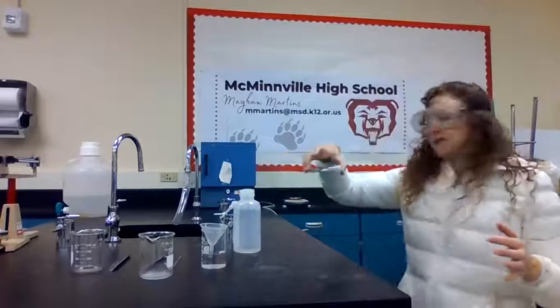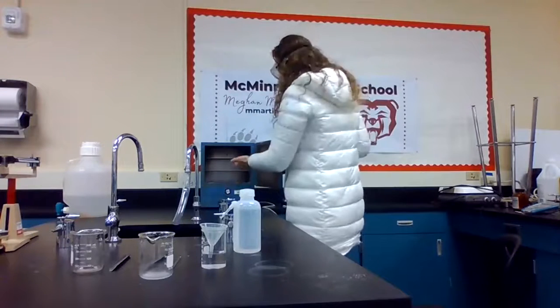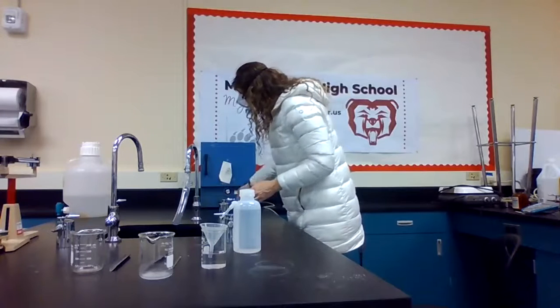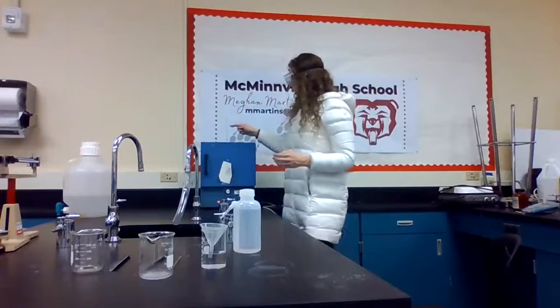And then what we do is we take this and we put it into our drying oven. So this is a drying oven. It's specifically designed to dry stuff. We'll put our watch glass in there. We'll turn it on. And this can track the temperature for us.